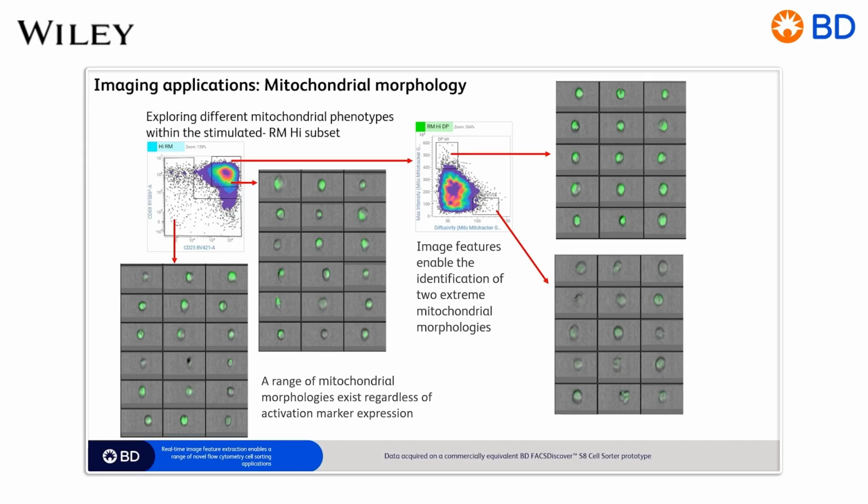And whether or not I'm looking at just the spectrum of activated radial moment of mitochondria, or I'm looking at discrete different phenotypes, I don't know. And then the other thing I noticed was even when I look at all those 69 negative or 69 positive, 25 negative, and 25 positive, 69 negative cells, I see a range of different mitochondrial morphologies.